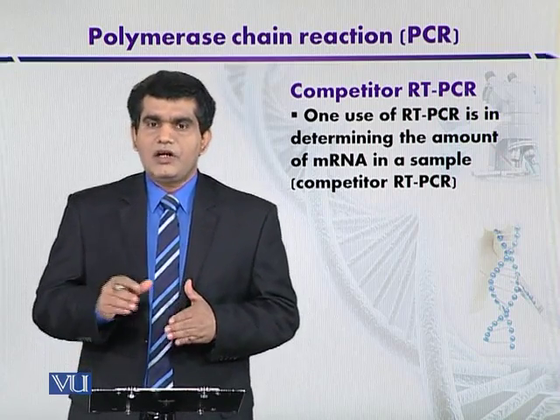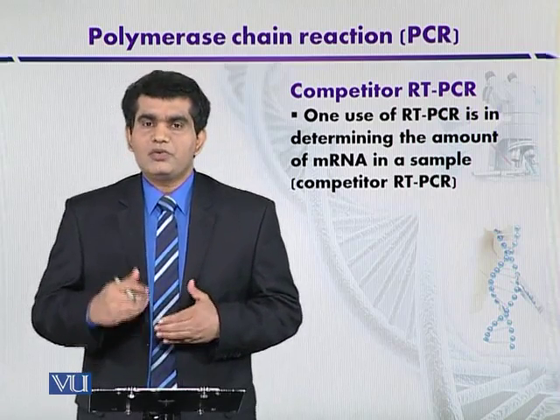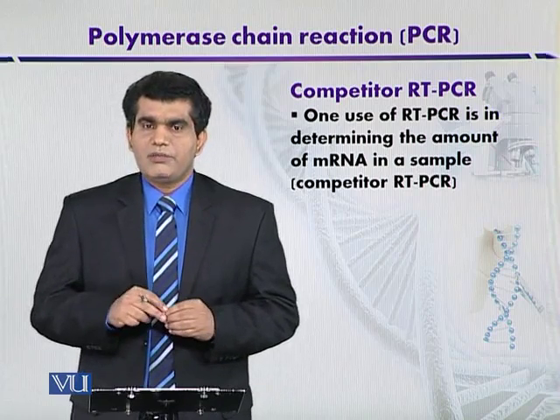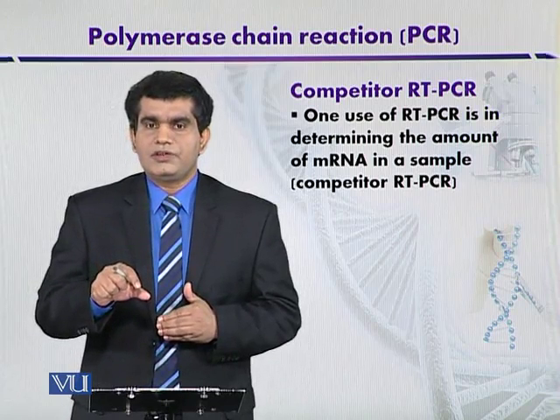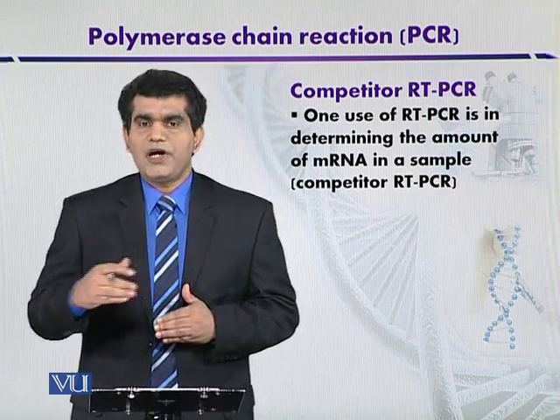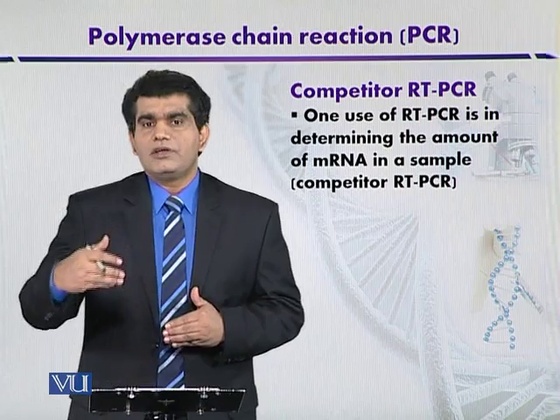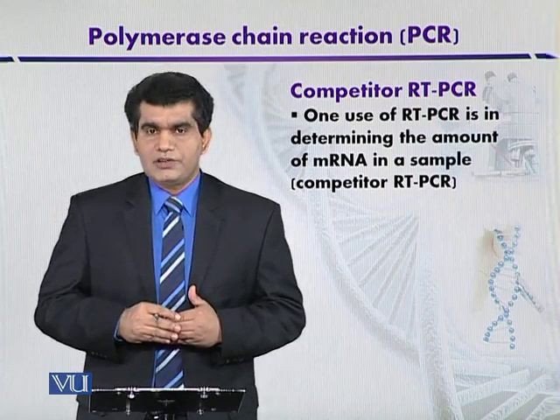So we can again come to our main discussion that this competitor RNA, how it can be used in the quantification process. So here we now have the idea that it is laboratory synthesized fragment, competitor RNA. We can prepare the known concentrations of the competitor RNA standard, and this process you can call it as the spiking. स्पाइकिंग एक ऐसा प्रोसेस है जिसमें किसी चीज़ की जो कंसंट्रेशन है उसको शॉर्पली इंक्रीज कर दिया जाता है और इसको फिर एज ए स्टैंडर्ड यूज़ करते हैं पीसीआर रिएक्शन में.